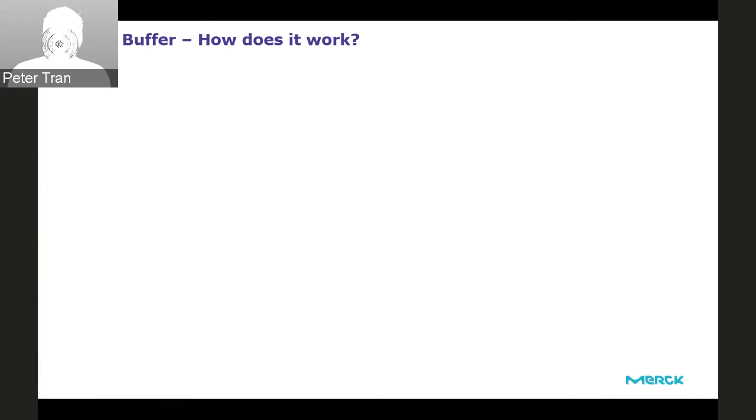Okay, that's very interesting. Most of you follow the publication for the target protein. That's really good, a good answer. And some optimize the buffer by yourself. It might be a little bit tricky, but it's highly recommended as well. Some use commercial buffer, which is very easy, right? Just buy and use it because it's already optimized for the sample type. And 14% of you use RIPA buffer.